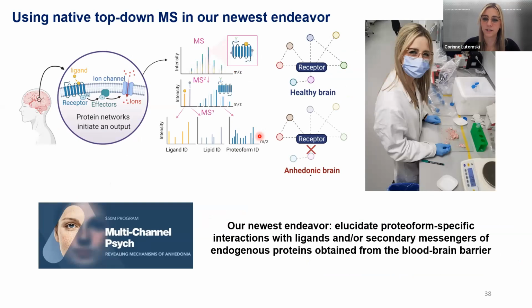We were recently funded under the Wellcome Leap program. It's called Multi-Channel Psych, and it's a series of teams working to decipher the molecular mechanisms of anhedonic depression. What we're doing now is taking these endogenous receptors, transporters, and GPCRs, and extracting them from human brain tissue.